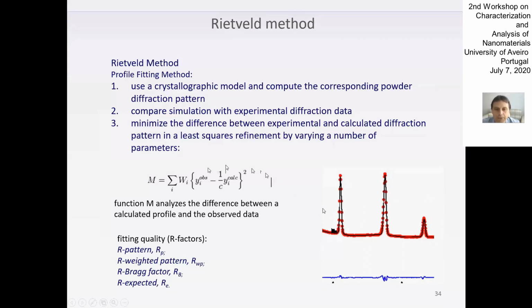And the idea of the Rietveld method is to minimize the difference between the observed spectrum and its simulation. So we have to refine this crystal structure.